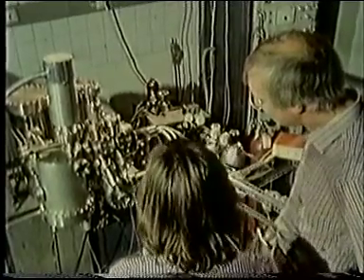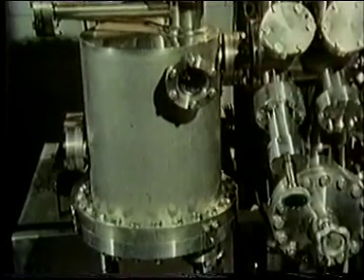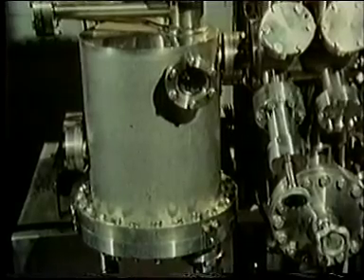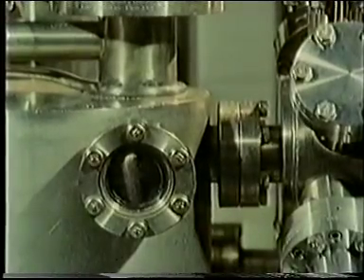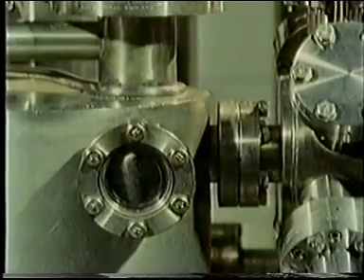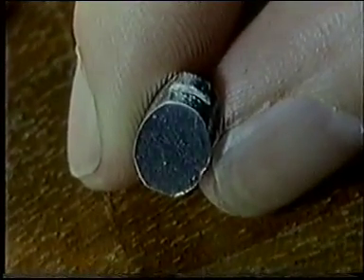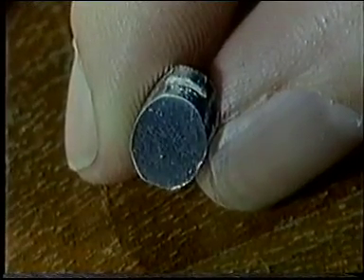Because the instrument analyzes emitted electrons, we must make sure that they don't collide with unwanted gas molecules. As in other kinds of electron spectroscopy then, the spectrometer chamber is maintained at ultra-high vacuum, around 10 to the minus 11 atmospheres. The sample is a single crystal of iron sliced to reveal its 111 face. As Professor Ertl mentioned, it has to be clean.